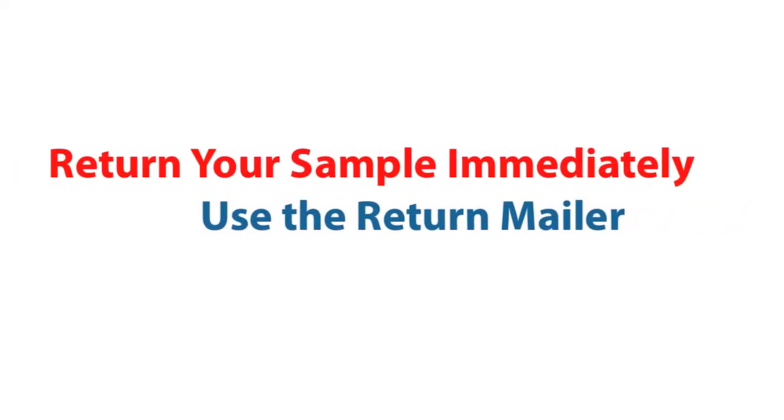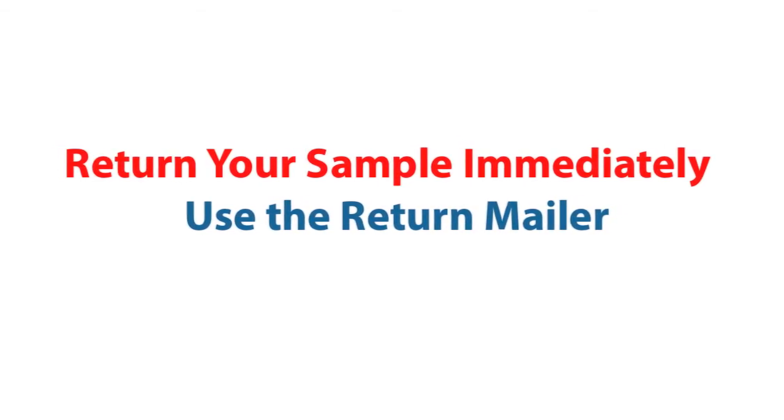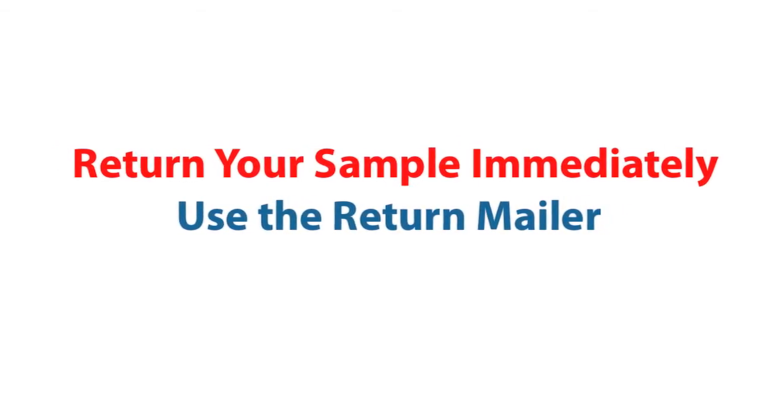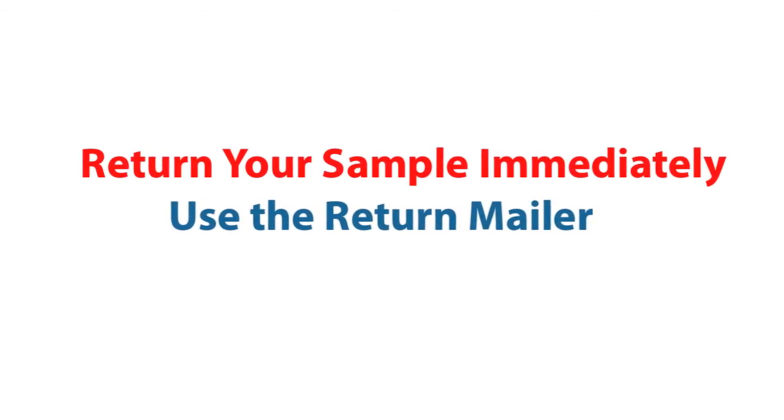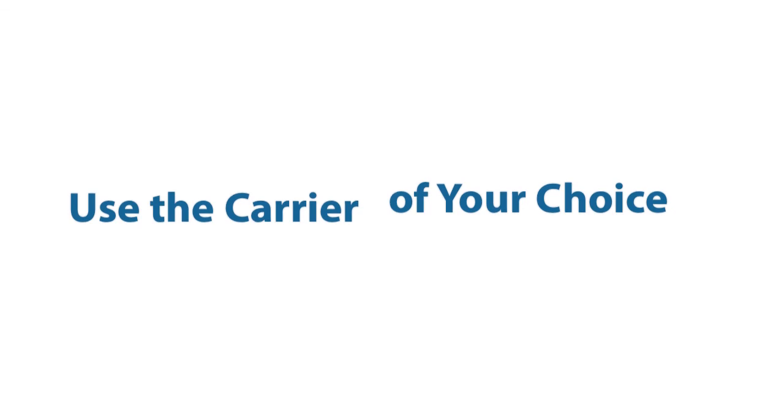Please note that if your sample included a test for oil vapor, the sample must be received in our laboratory within 15 days of taking the sample. But in all cases, it is best to return the sample promptly. They can be mailed or shipped via UPS, Federal Express, or the carrier of your choice.